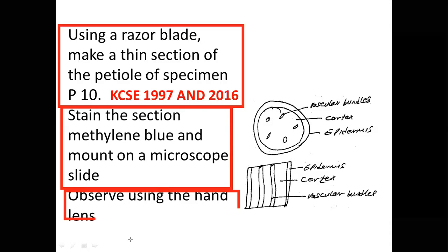And this is the reason. If it is a stem, this was now a stem, we are likely to observe tissues. Okay, tissues whose arrangement is the pattern. Here, it may not narrow down to the cell per se. Here, the examiner wanted us to see the pattern of tissues.